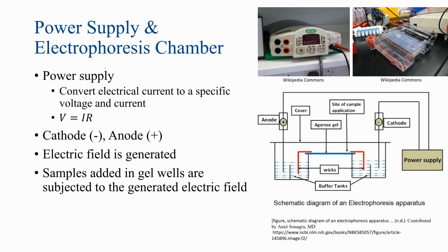Hello and welcome to this module on electrophoresis theory. Before I begin discussing electrophoresis theory, I want to briefly introduce the power supply and the electrophoresis chamber, because an understanding of both the power supply and the electrophoresis chamber to some degree is important to understanding the electrophoresis theory.